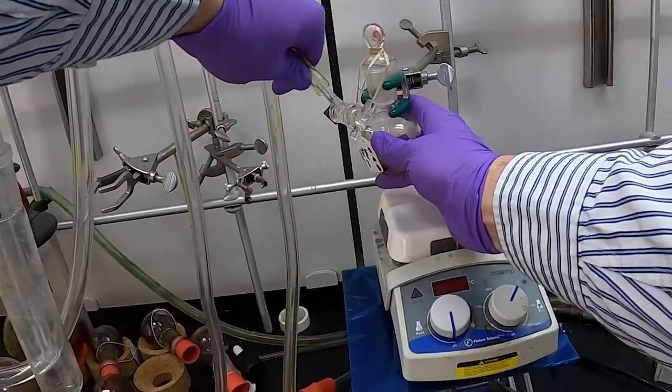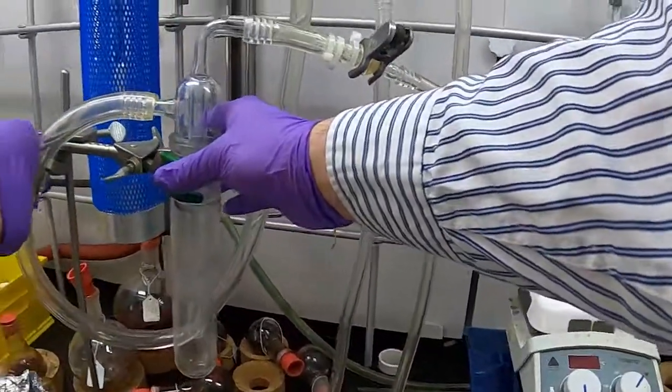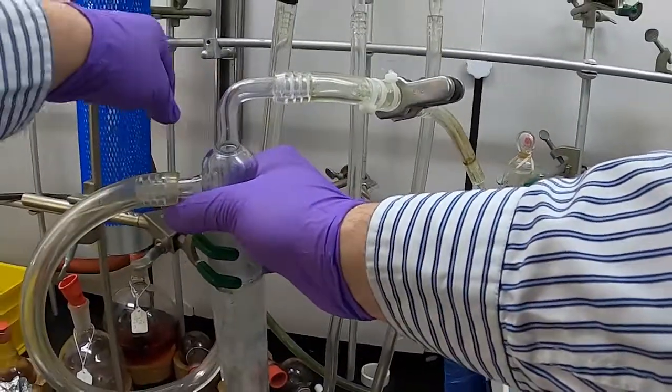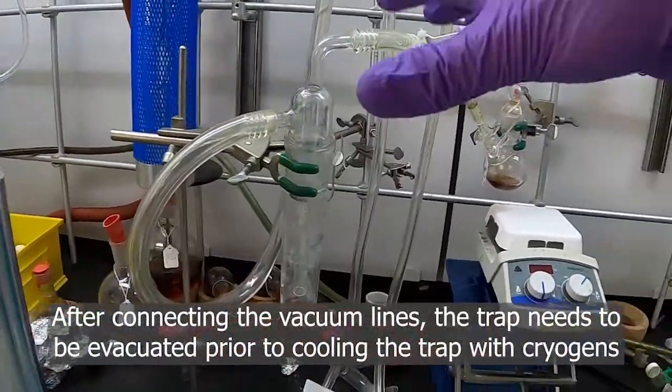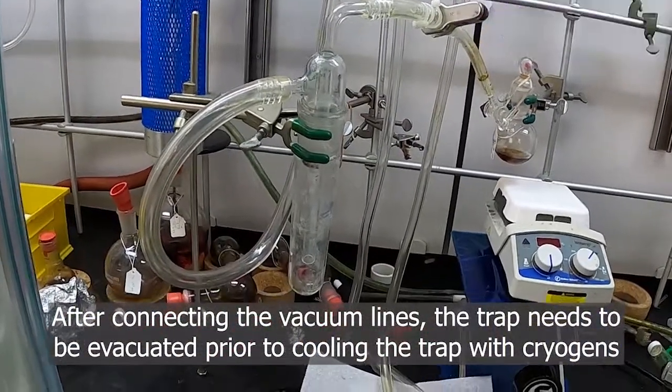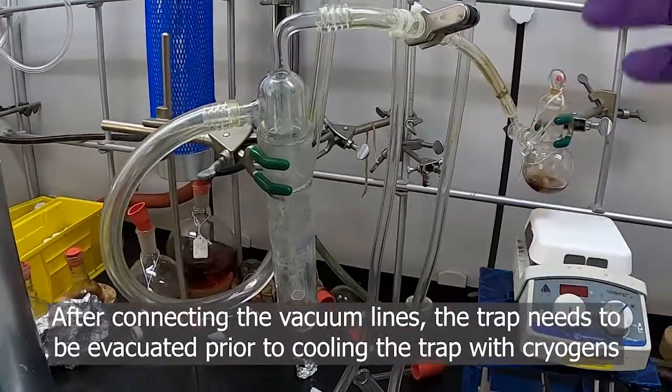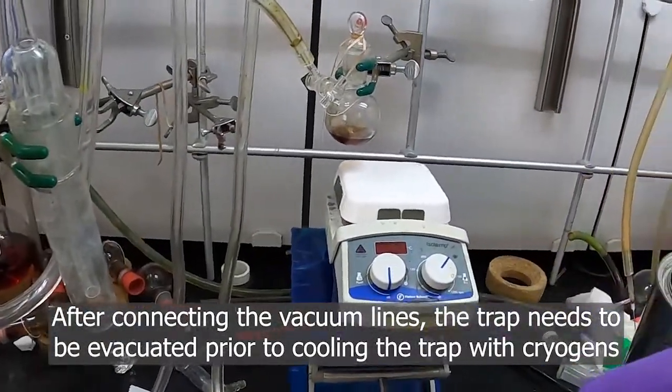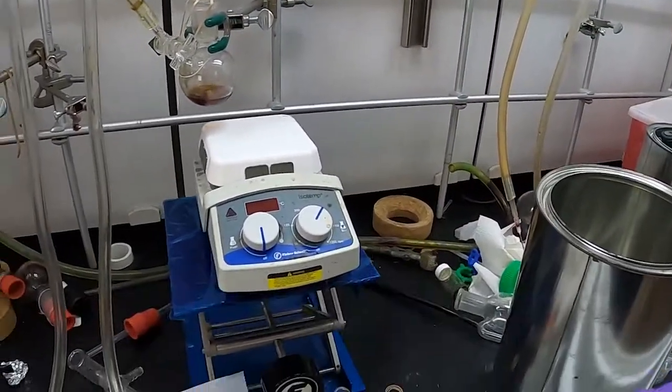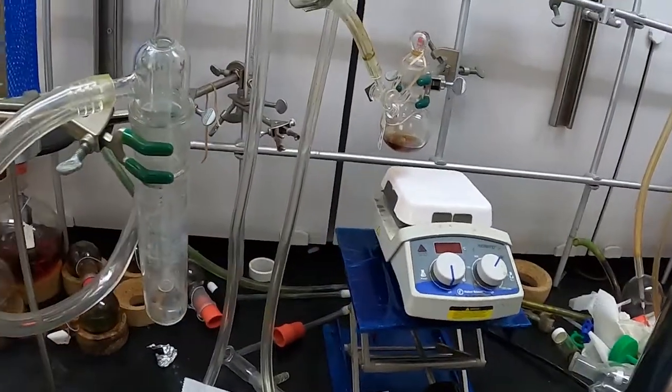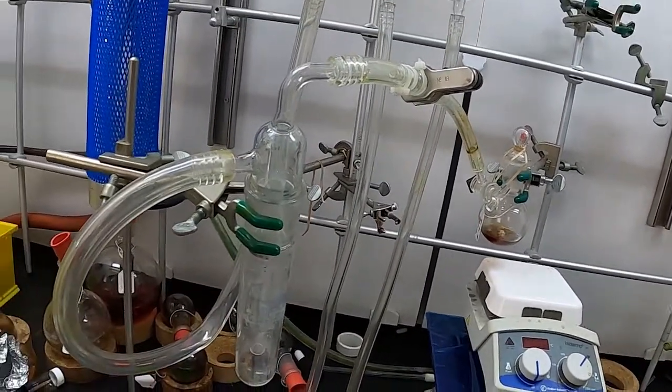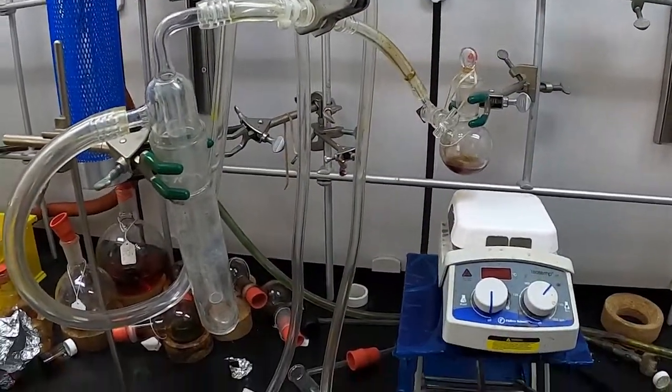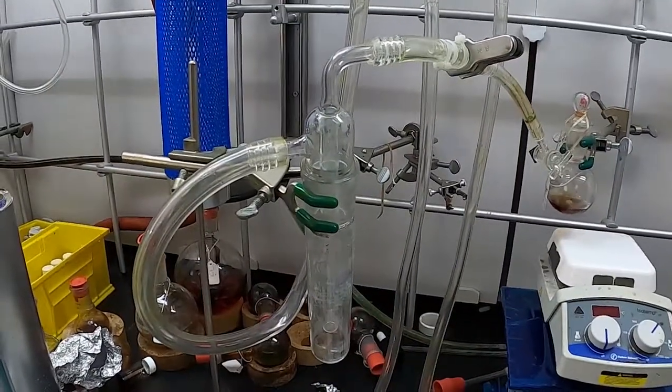The first thing we want to do is start by evacuating our trap. We want to get all the air out of this so we don't end up condensing liquid oxygen at all when we put this under a cryogen. We then open our vacuum pump here. You can hear the vacuum evacuating this whole trap setup, and we let that gurgle for a couple seconds.